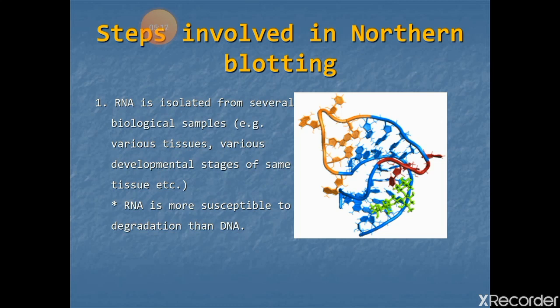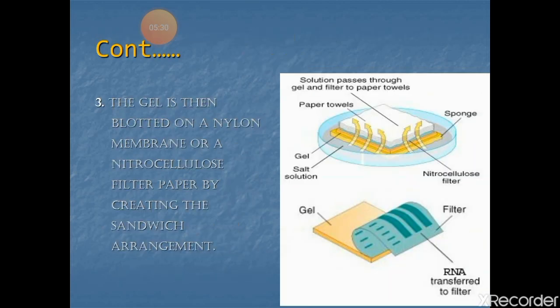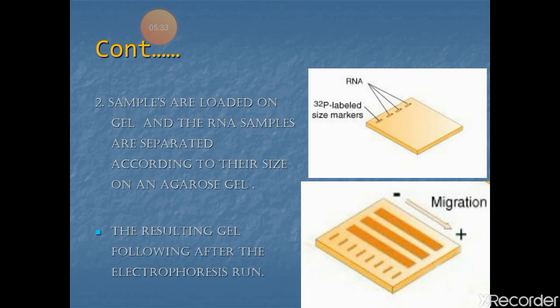First, the RNA is isolated from several biological samples like tissues and various developmental stages of some tissues, and this RNA is more susceptible to degradation than DNA. The next step, the samples are loaded onto a gel and the RNA samples are separated according to their size on the agarose gel. So first is isolation, next is loading onto the gel electrophoresis, where it gets separated according to size.